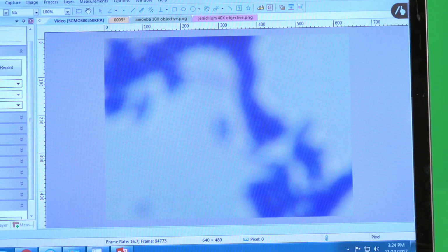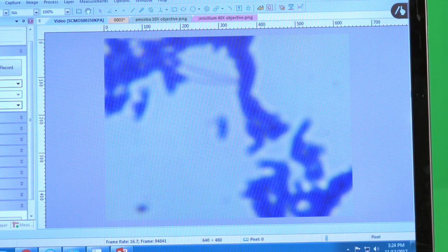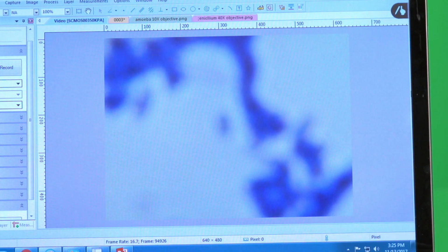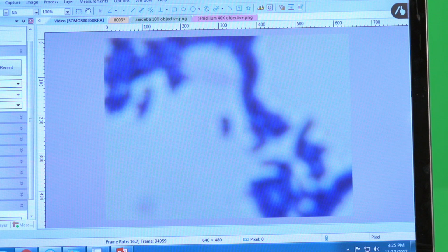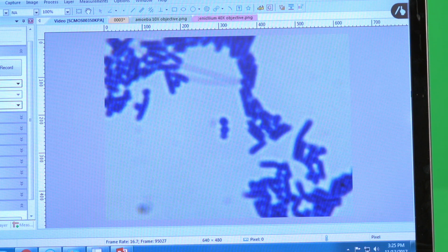All right, well, we're going to leave it like that. Let's zoom out just a little bit. Okay, I can't control myself. I need to try to focus it just a little. That's good. Patience is a good virtue or a skill of a microbiologist.